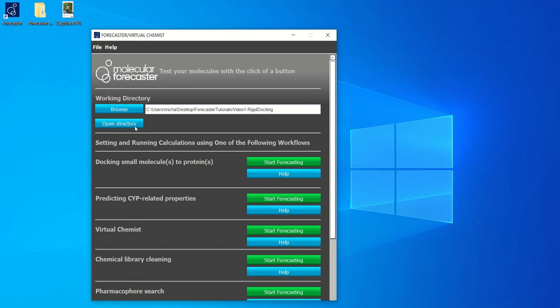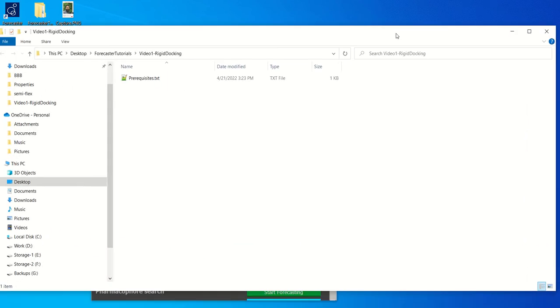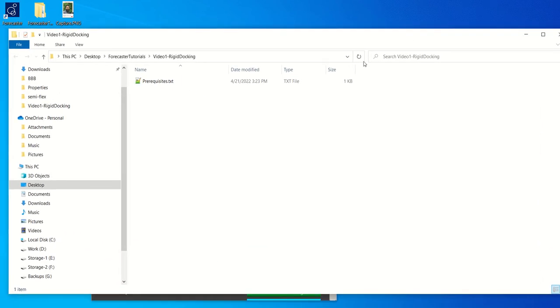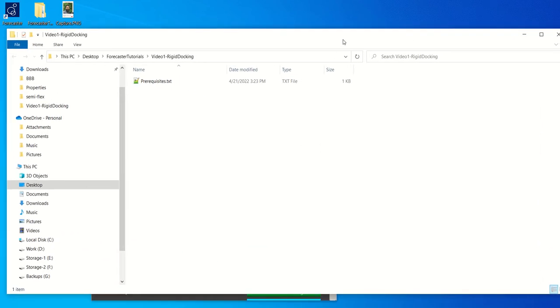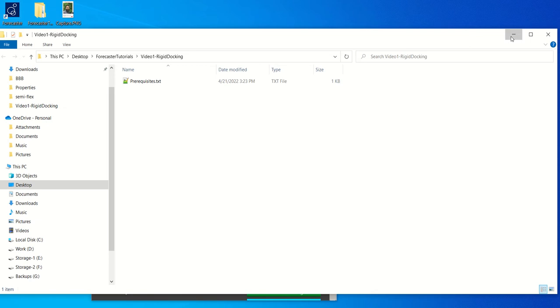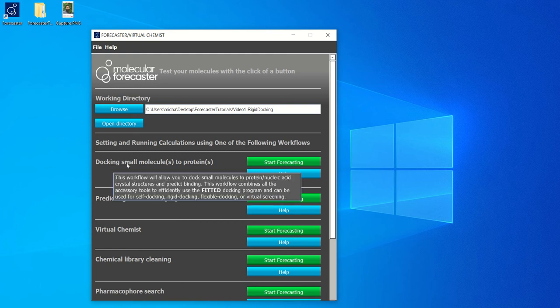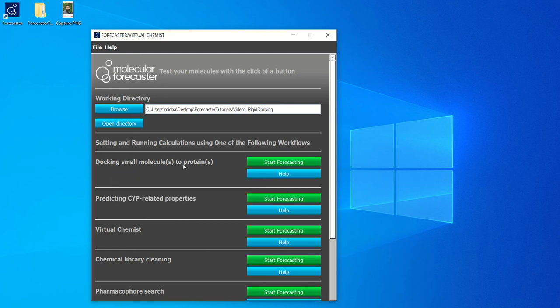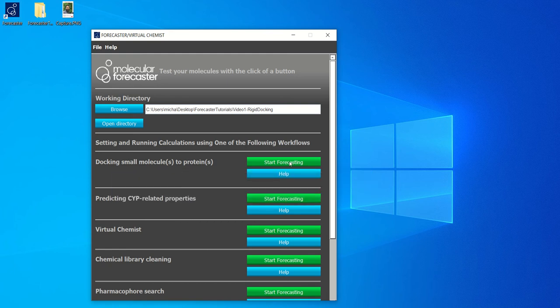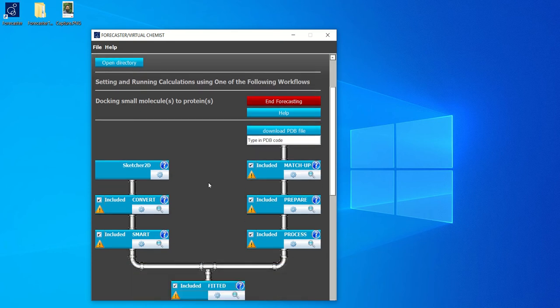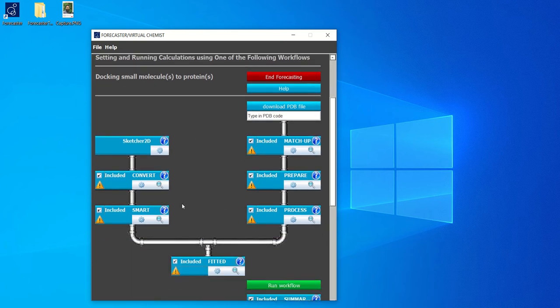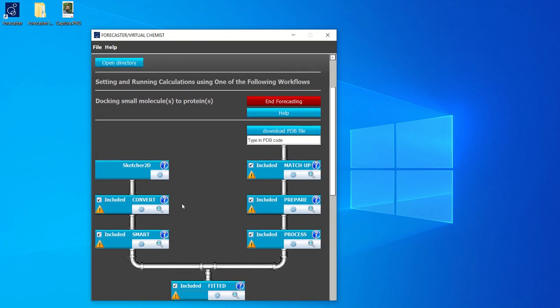You can also open the directory in your file explorer and you will see that for now it is empty. Since we're going to do rigid docking, we will choose a preset workflow called docking small molecules to proteins. You can click on start forecasting and we will see different modules that have already been preset to run a successful docking campaign.